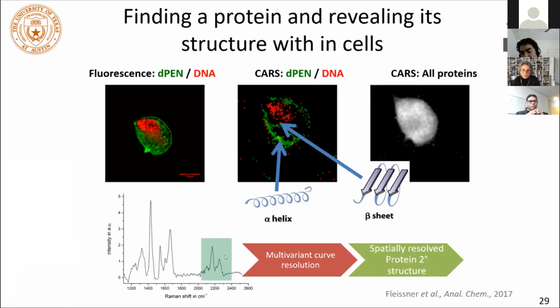Yeah, sure. It's a coherent process, right? The enhancement that you get requires coherence, so that requires lots of oscillators in the same place. That's exactly right. There is no single molecule CARS. Some people have tried to do it. Usually it's plasmon enhanced if it's going to happen. Maybe you could do single molecule CARS, but you could also do single molecule spectroscopy straight away, so you don't even need CARS if you're going to do that. Those are the things that Sumit tries to do a little bit. So you don't really have single molecule specificity here. You need to see clumps in that sense. So you don't see individual fibers in a hydrogel, but you see groups of fibers. You don't see individual fibers in Vimentin, but you would see groups of fibers.